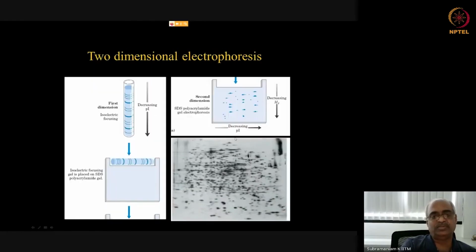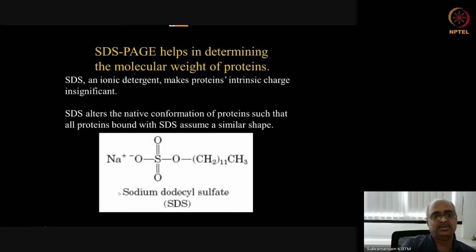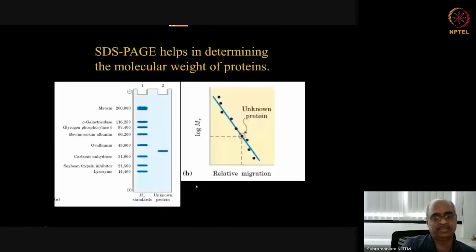And that tube, what we do is place it on an SDS-PAGE slab gel. Okay, so here the comb is like a flat single plastic sheet, and therefore it will make a single big comb. And in that space, you push this tube into it. And now you soak it in SDS buffer, and this is of course made in SDS buffer. Although the line is not drawn in this, this is a discontinuous gel, just like the one that I showed you here. The discontinuity is there.